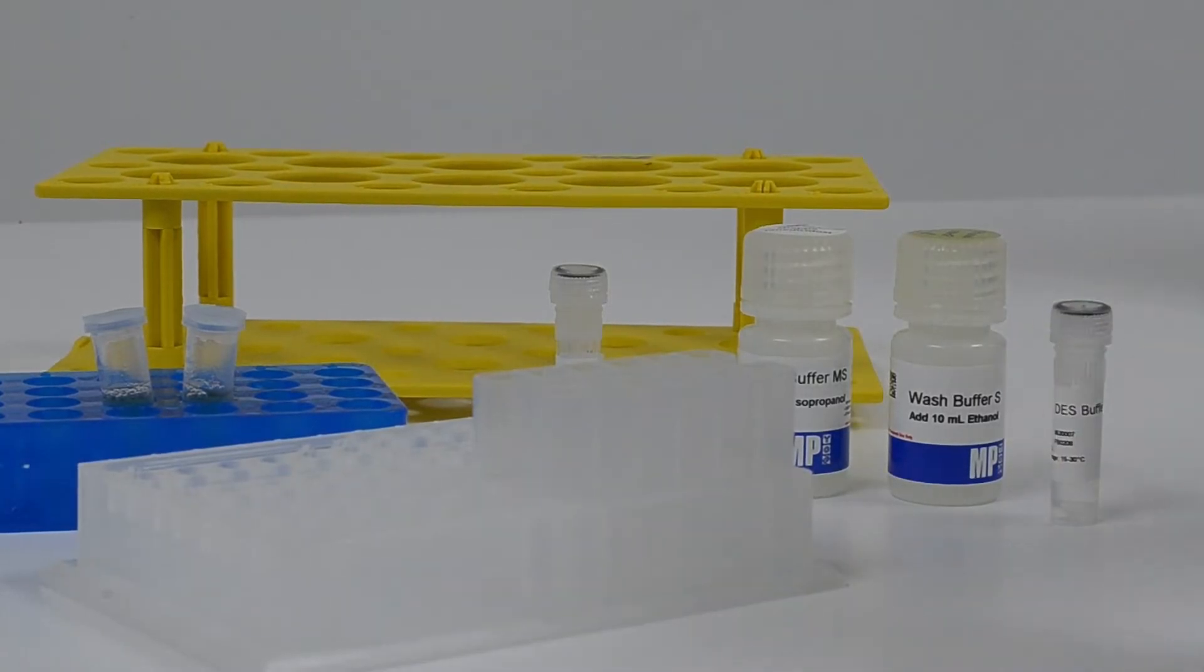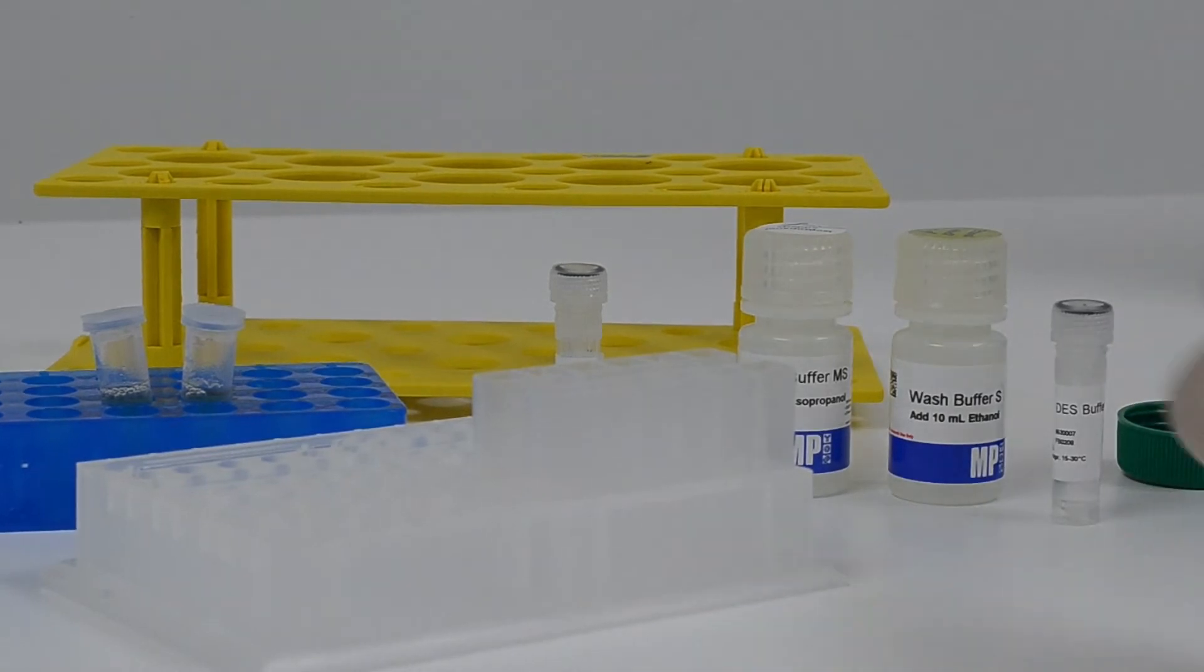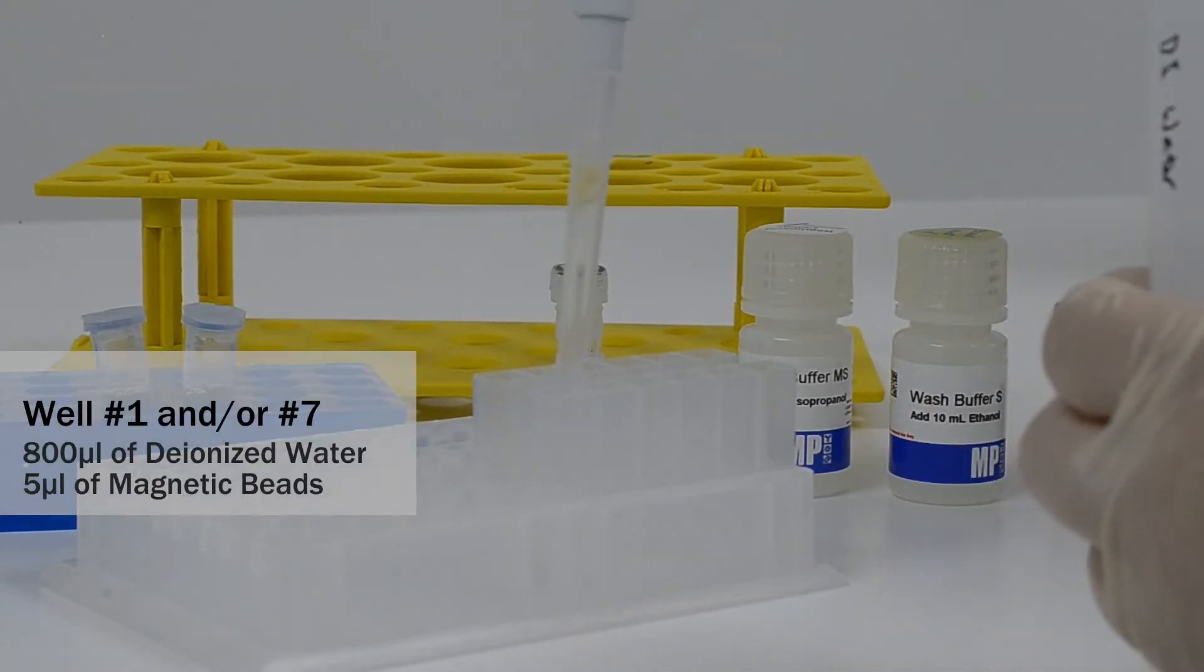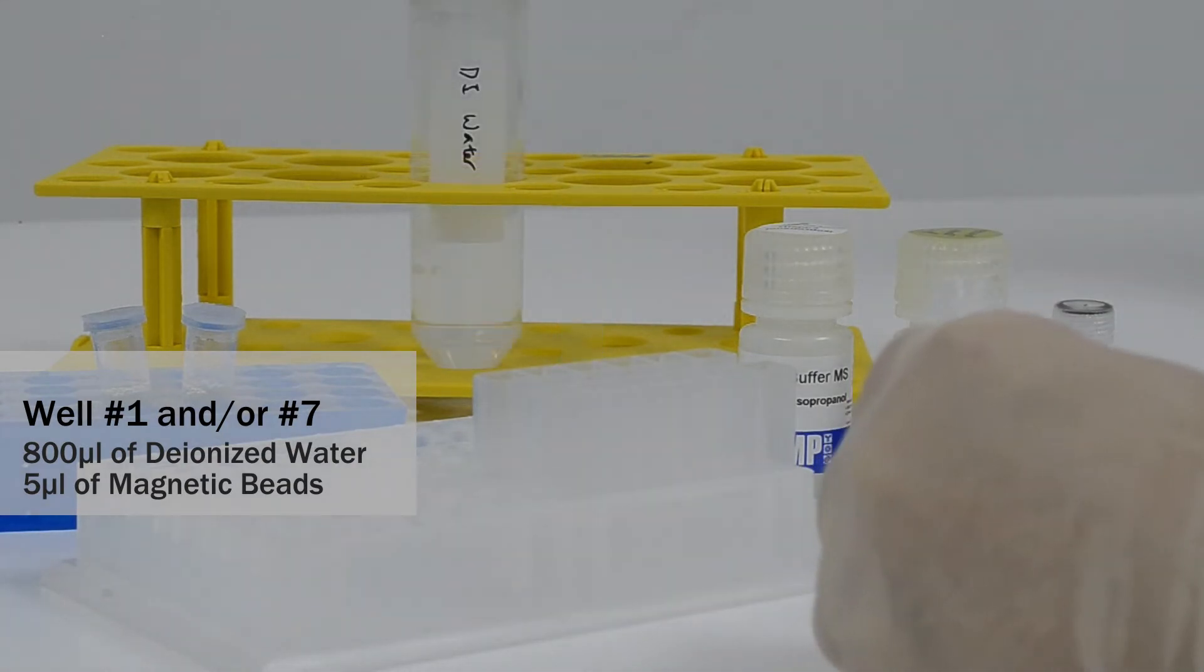Transfer 800 microliters of deionized water and 5 microliters of magnetic beads into the first well. When using 96 deep well plates, you can allocate it in the first and seventh well or column.